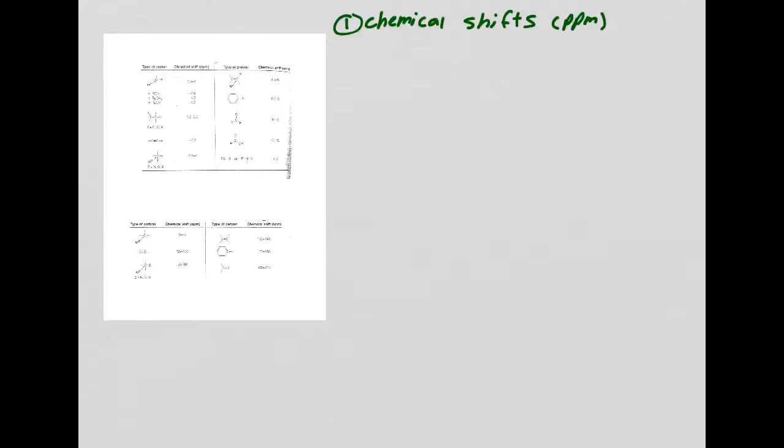Now, we are talking about proton NMR. I need you to remember that what we're looking at are hydrogens, because we're talking about proton NMR. Don't forget that. Don't forget the little things. All right. You ready to do this?